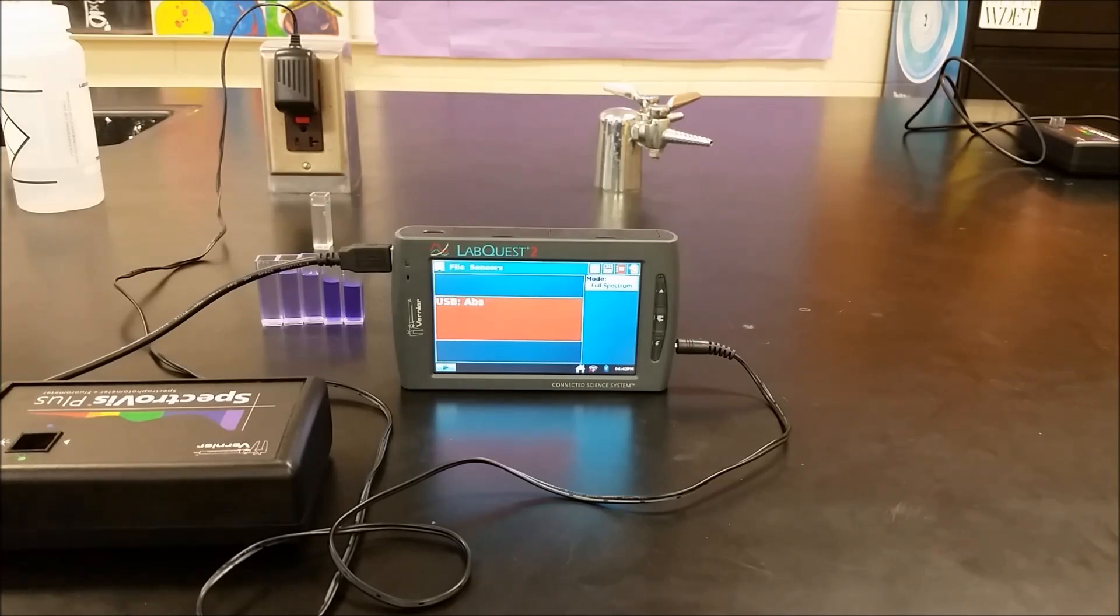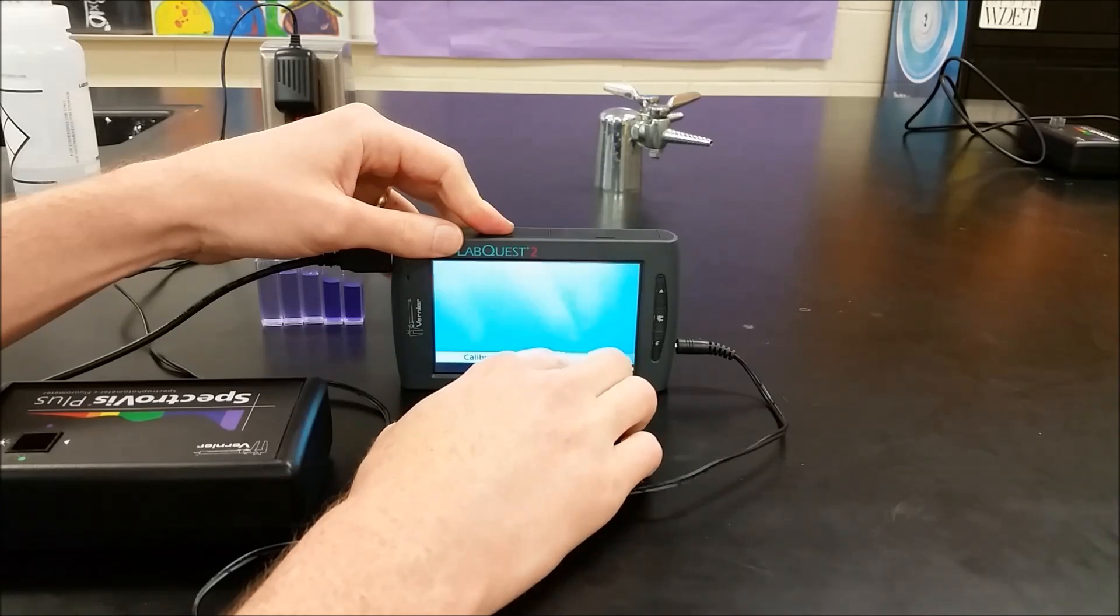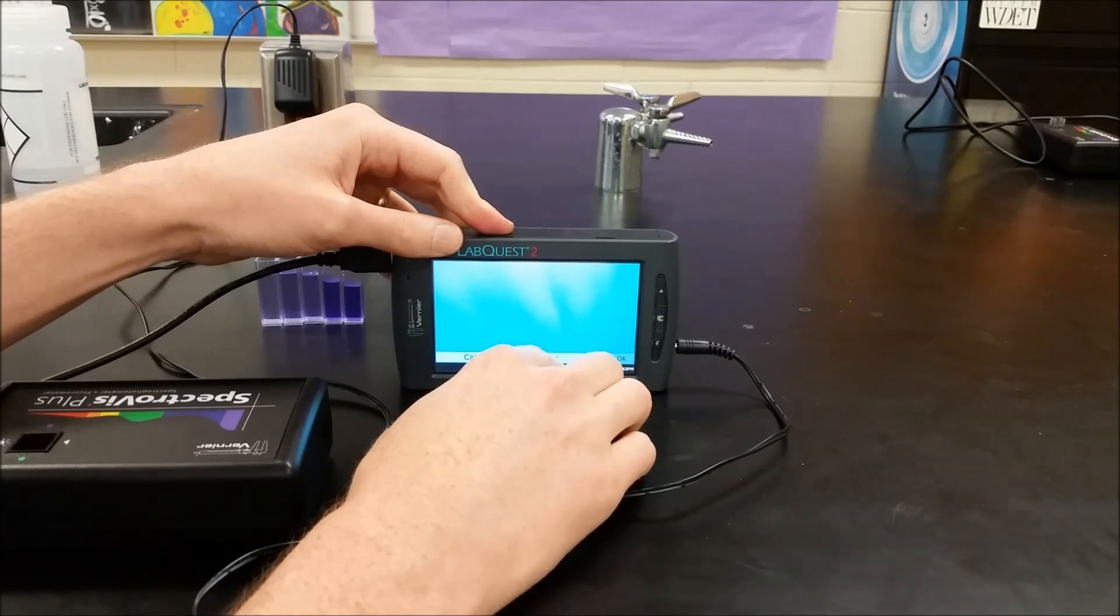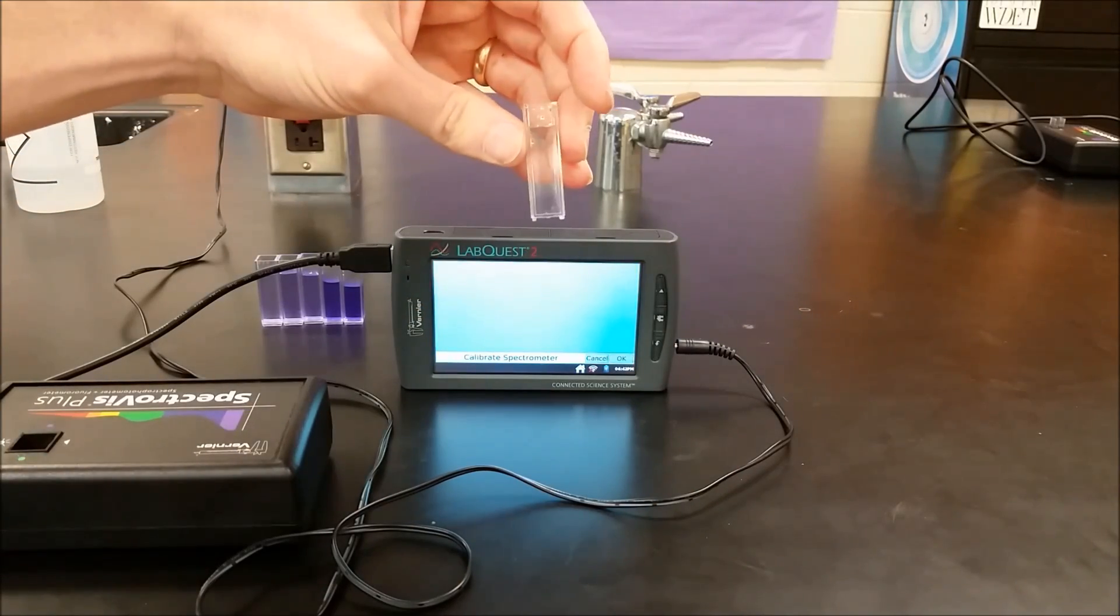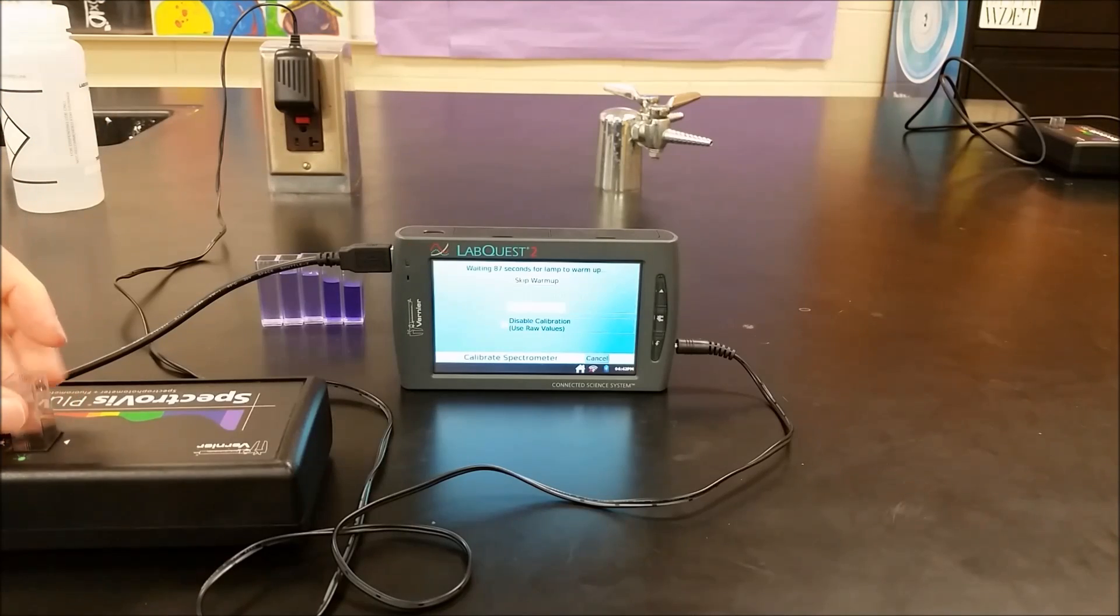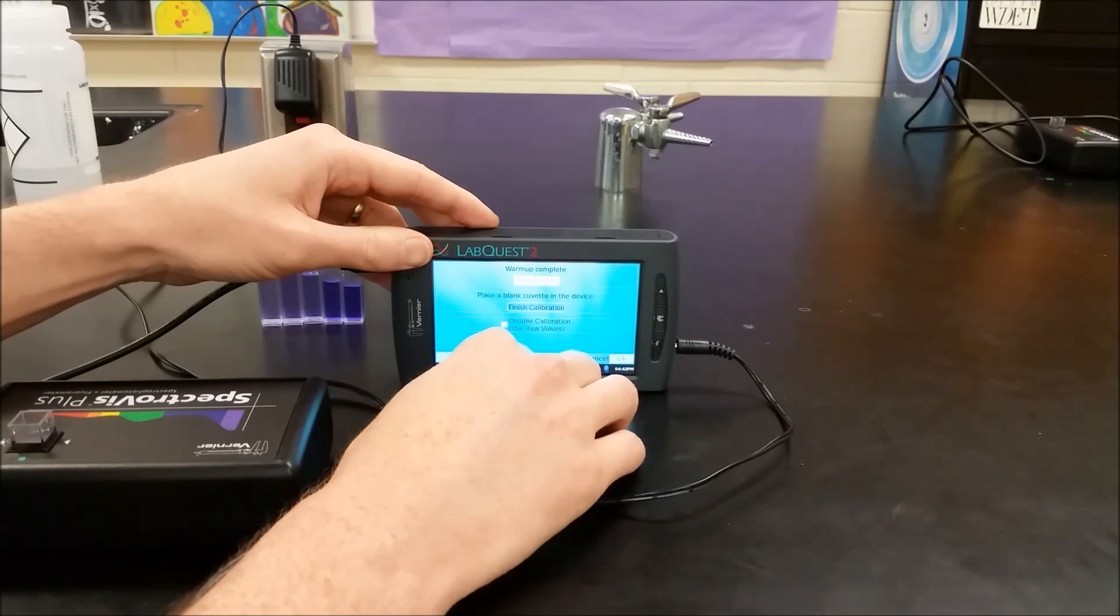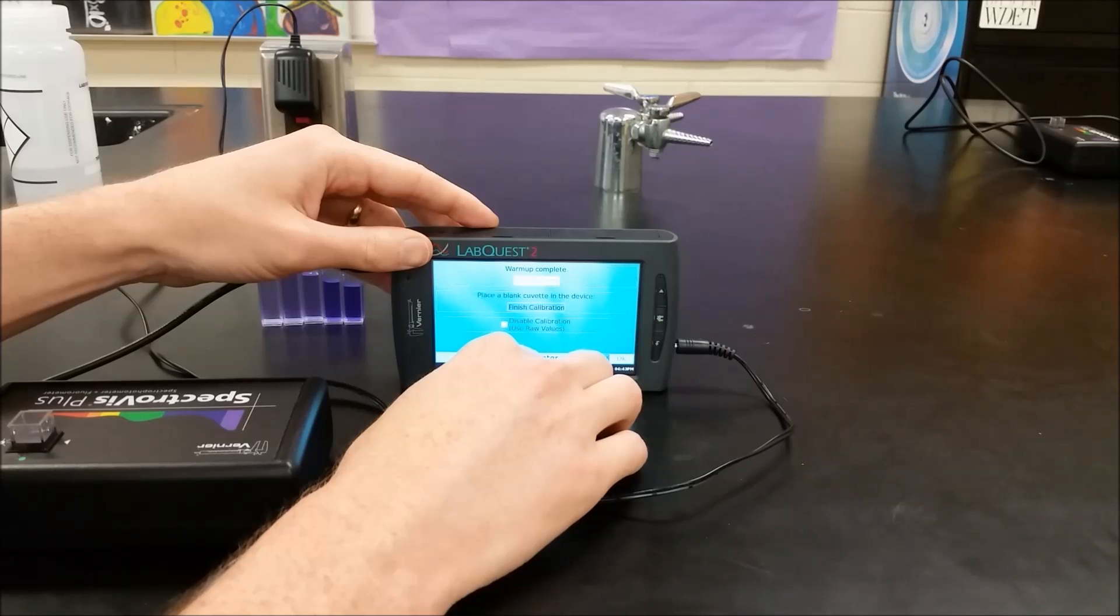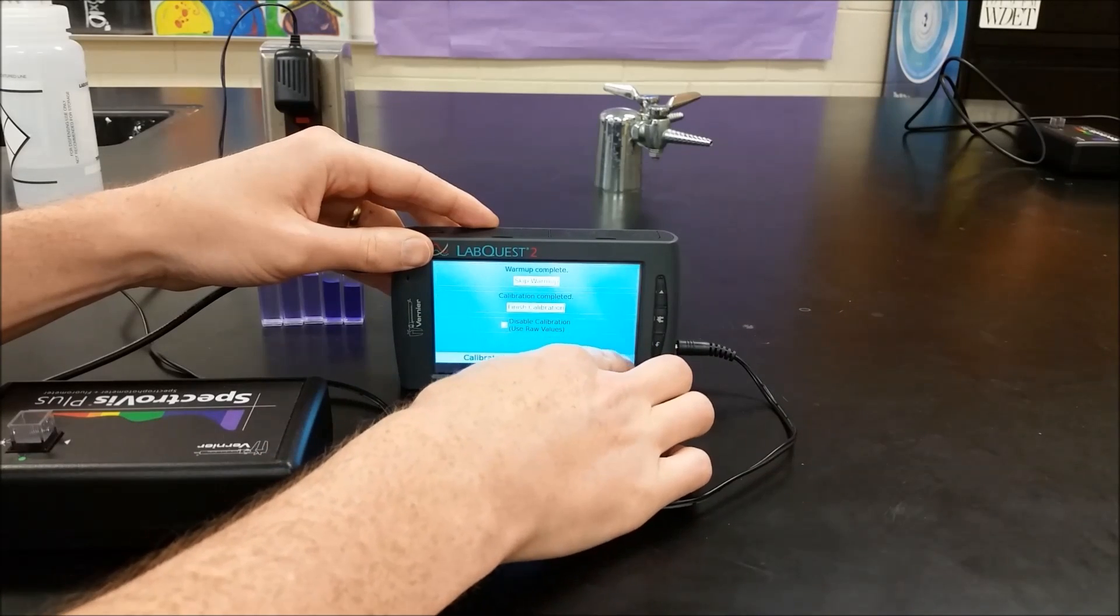We're going to use the LabQuest 2 to plot them. Before we do that, we should calibrate. If you go under sensors and calibrate and select your spectrophotometer, it will bring up a thing. You can take a cuvette of distilled water. You want to take the side that's not the wet side, of course, and put the clear plastic side through there. And this is already warmed up for quite a bit, and so we're just going to click on Finish Calibration. And that's going to take our baseline and set it to zero for all the different wavelengths.